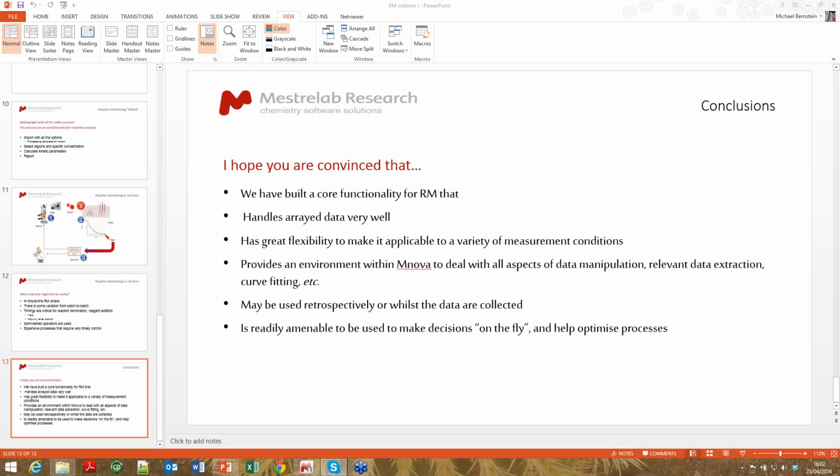Perhaps if the reaction's gone to completion, you can use the last data set to work out the final concentration. So if you see the final concentration of your product is the same as the initial concentration of your reactant, then you could do it that way. But there are other ways of determining concentration, and we can go through that next time.